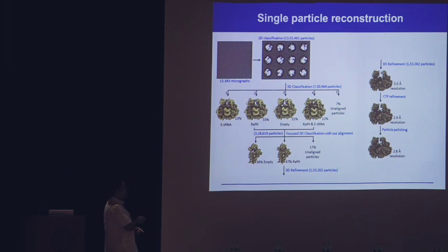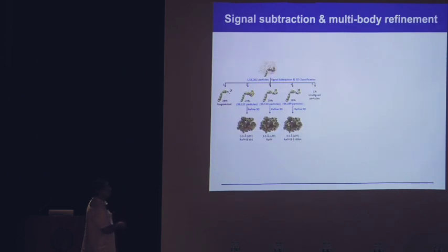But at this stage, you are picking each particle and looking at how it has drifted throughout its movie. Suppose you got a 25 movie frame. You are taking one particle and figuring out how it has drifted and applying correction back for each individual particle. That has helped us to improve resolution, not much, but the quality of data was improved very much.